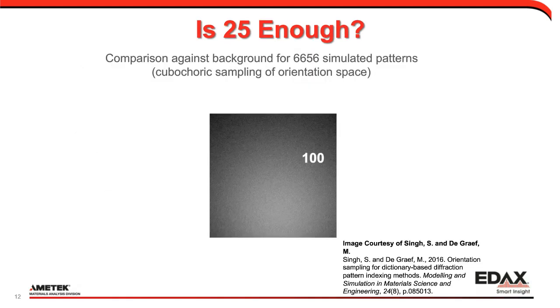Now, again, 25 patterns can sometimes not be enough. So some recent work from, I believe, the CMU group, including Mark DeGraef.